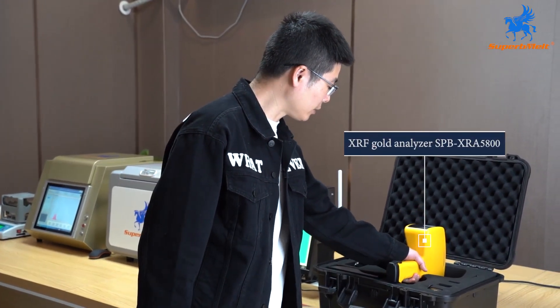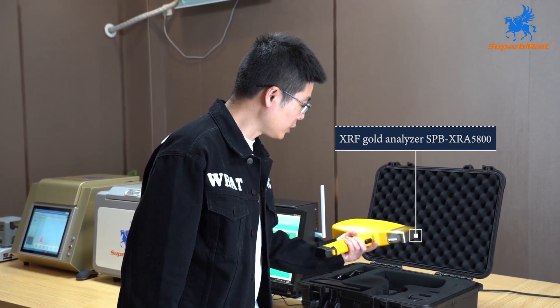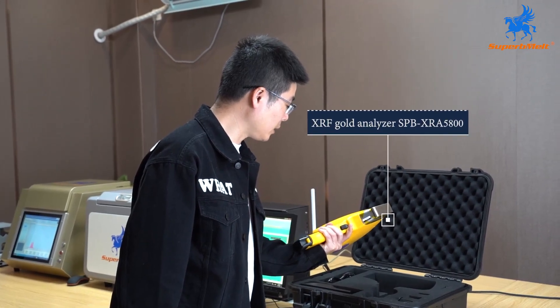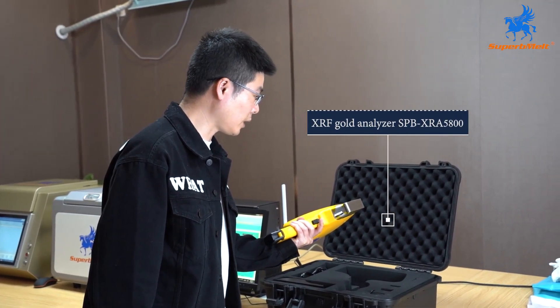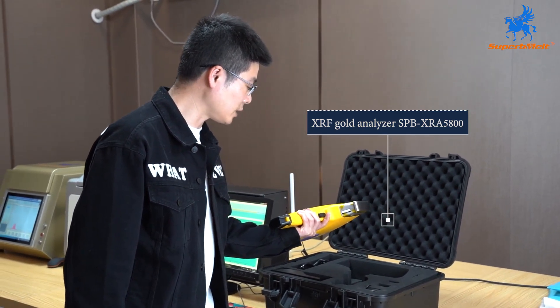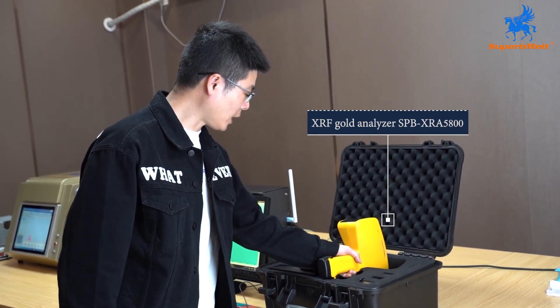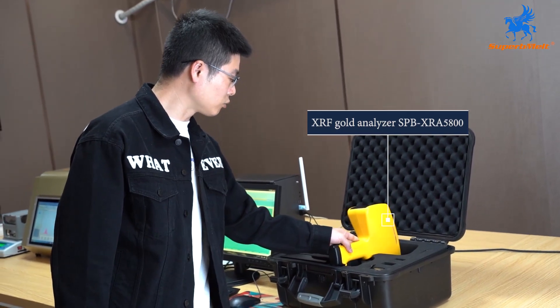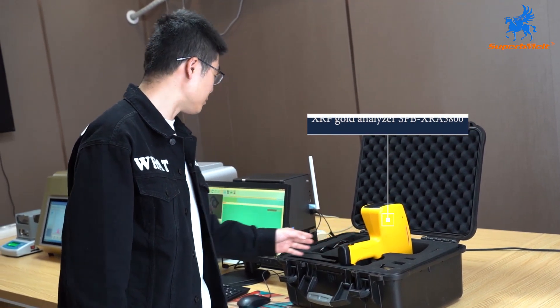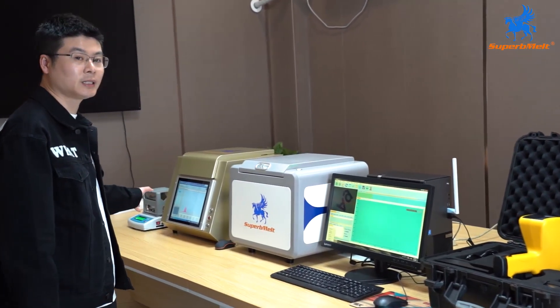The Superb Melt XRF analyzer XRA 5800 is specifically designed for non-destructive, fast, and high accuracy analysis. At only 1.6 kilograms, it is very convenient to carry outside. It can identify elements in gold, silver, stainless steel, cobalt alloys, bronze, zinc alloy, nickel alloy, rock and mines, inclusive of all 72 elements from sodium to uranium.